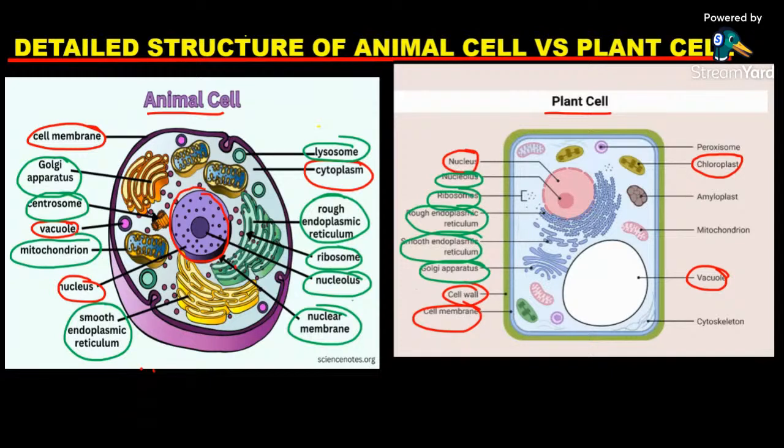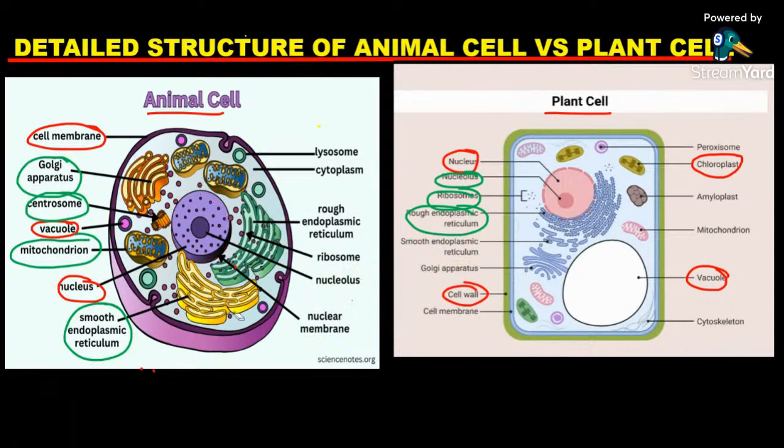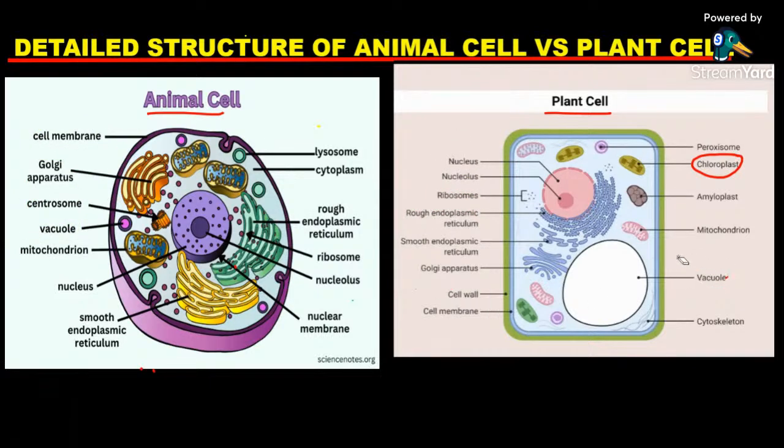So what is next, or something that we are going to look at next, is now to look at their functions. We'll be coming back to refer to the parts and look at their structures, because in looking at their functions, we are going to look at a bit of their description. So that is very important. Okay, so let us go on and look at the functions of these parts. What are the functions of these parts?